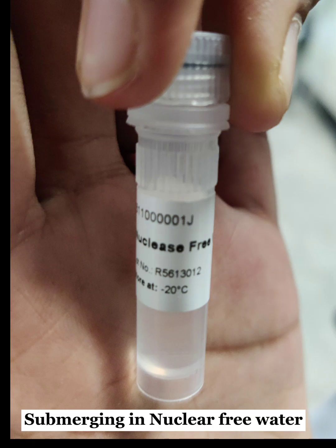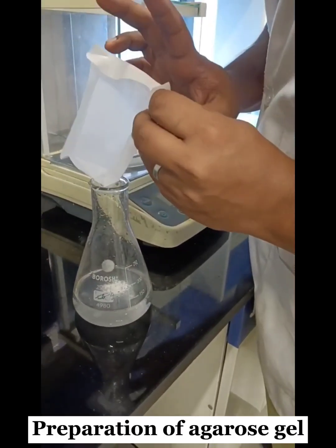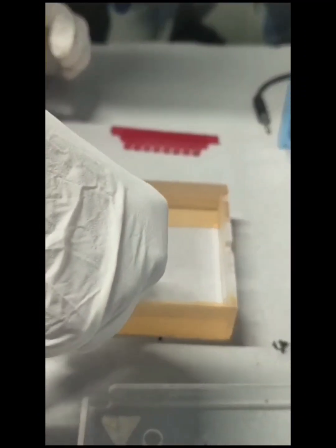Nuclease-free water was added to the pellet. We measured one gram of agarose and dissolved it in 100 ml of TAE solution. After heating the mixture, we added 20 µl of EtBr and poured the mixture to create a gel.